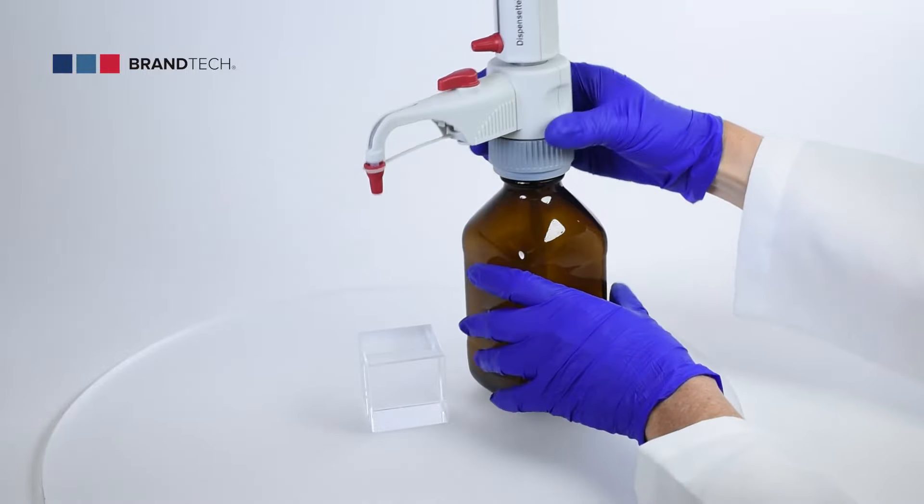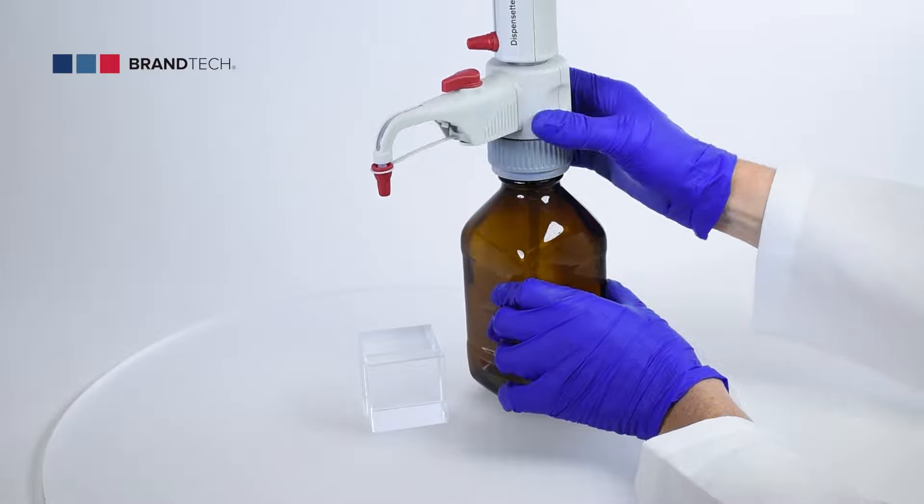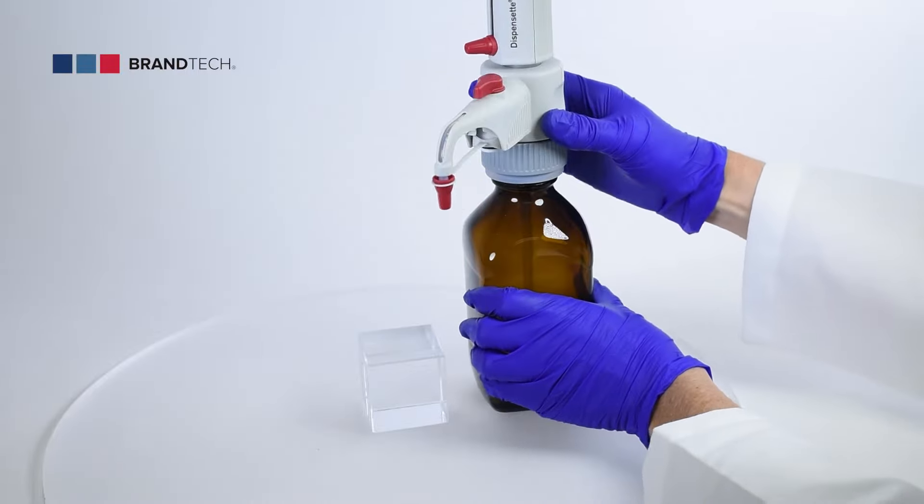The Dispenset S has a rotating valve block which allows you to position the dispenser with the bottle label facing you at all times.